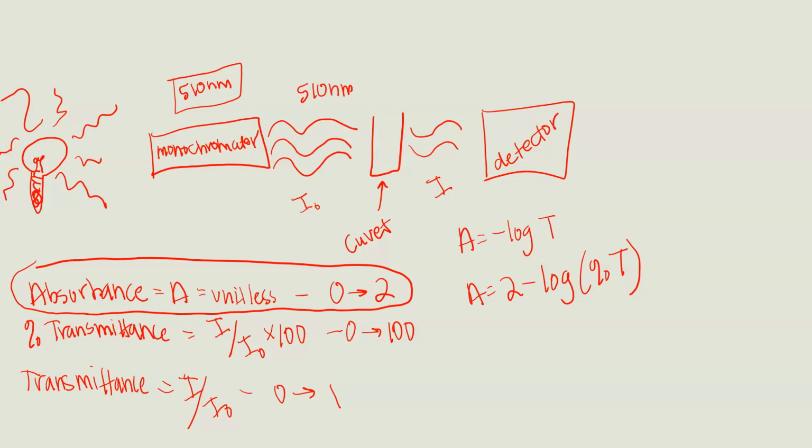Okay. Now, for the lab that we are doing, we're reacting iron. This specific lab experiment does not directly correspond to one of the chapters in General Chemistry 2. It gets us practiced with a technique that we will then use to apply to equilibrium, which will be the next lab. So for this lab, we're just doing a chemical reaction with iron. Okay, so iron 2 ion, and we're going to react it with O-phenanthroline, which is an organic molecule.